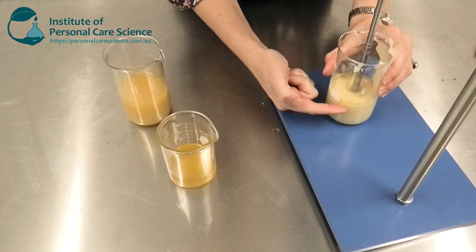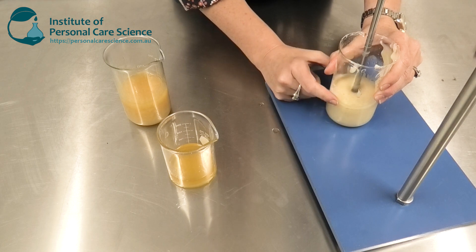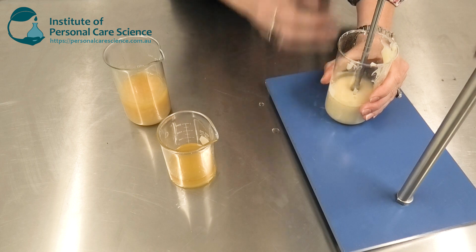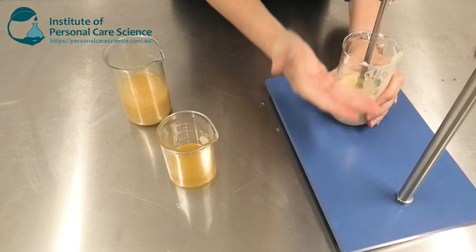Again you can see that addition of oil isn't stirred through thoroughly yet — we just need to make sure it is stirred through properly to get that homogeneous mixture and network formed. I'm going to adjust the propeller height again so that we can make sure we get mixing through the entire volume.